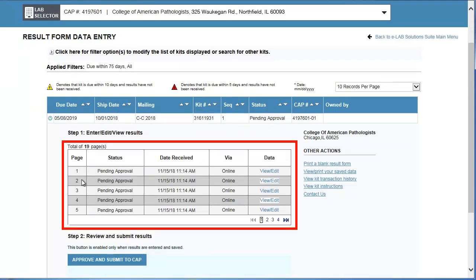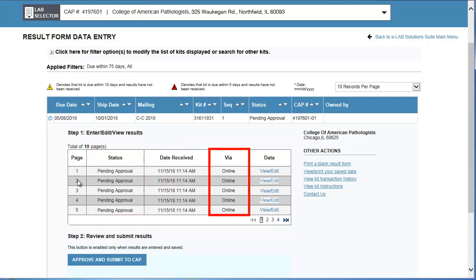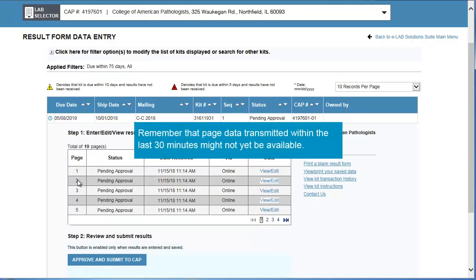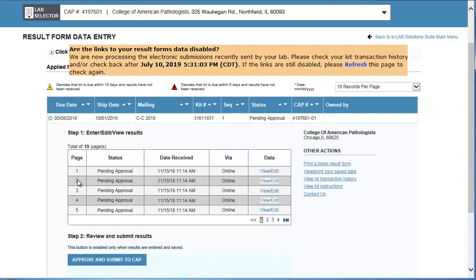Below you'll see all the available pages for the kit. For each page, you'll see its Status, Date Received, and Method of Receipt, either fax or online. Remember that page data transmitted within the last 30 minutes might not yet be available. A message reminds you that if the links are disabled, you'll have to check back after a certain time.